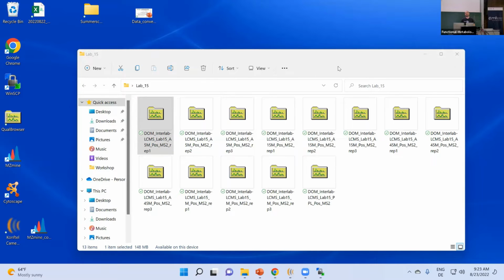This is okay, then you know the run of file. So generally, I would look at the retention times of the main features, or if I had an external QC. We typically run a 6 mix with 6 compounds. Throughout my acquisition queue, I check if the retention time was stable.